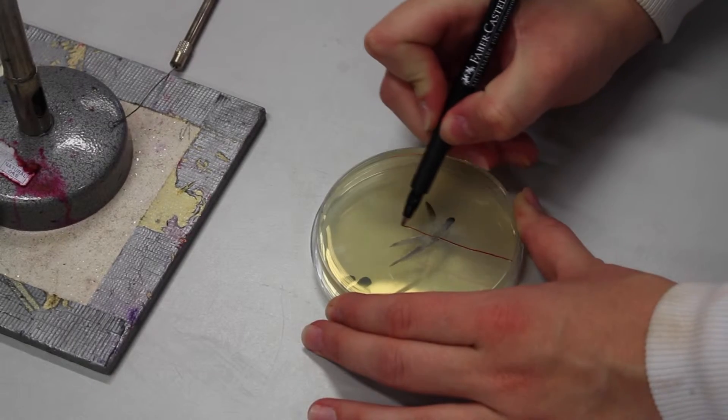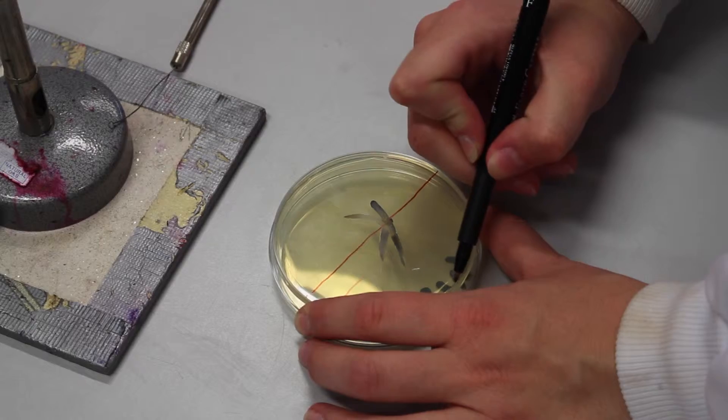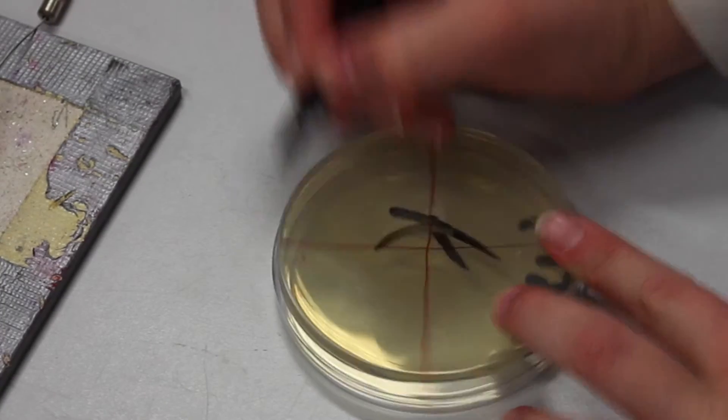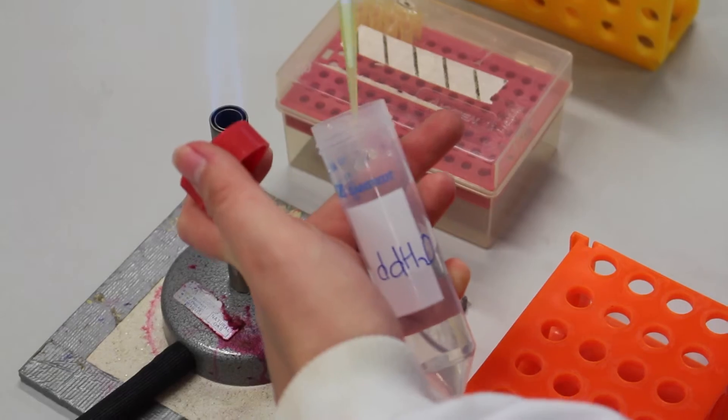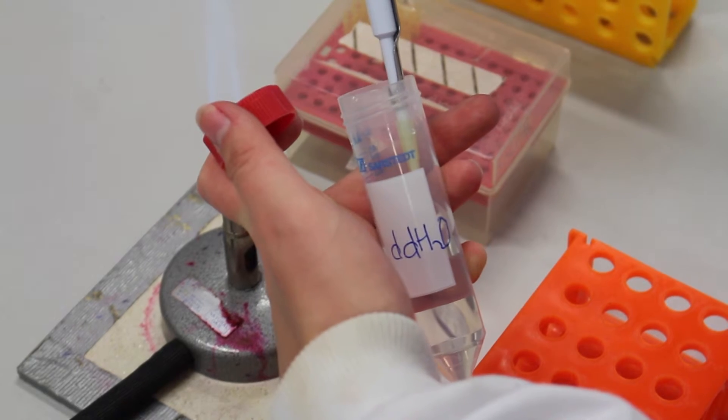Divide an agar plate into four labelled quadrants by marking the back of the plate. Add 20 microliters of distilled water to an eppendorf tube.